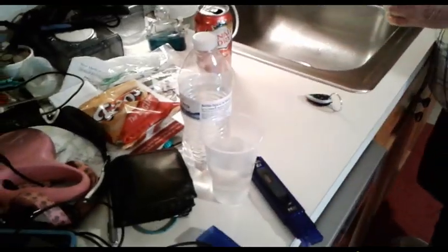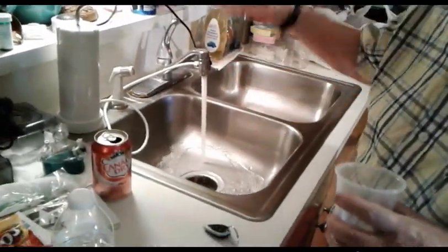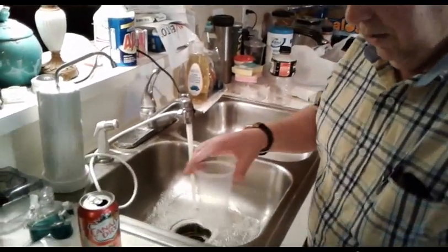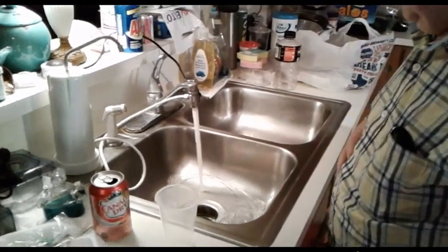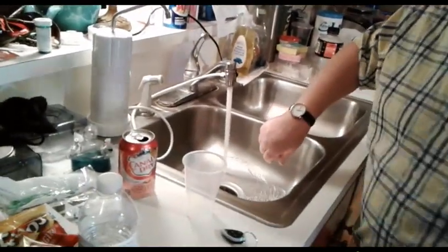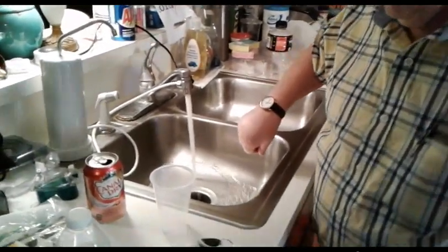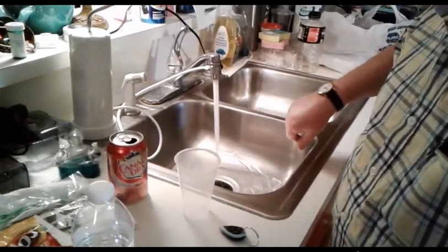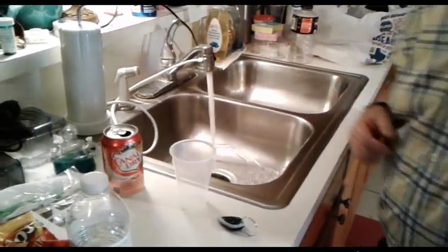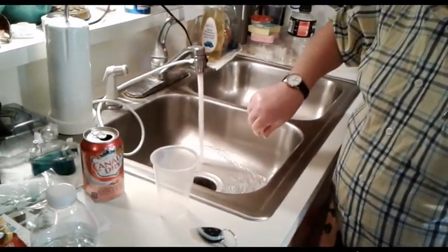Okay, let's try the tap water now. I'm going to let it run for about 30 seconds — flush the crap out of the water line, maybe a minute. I can smell the chlorine in it.